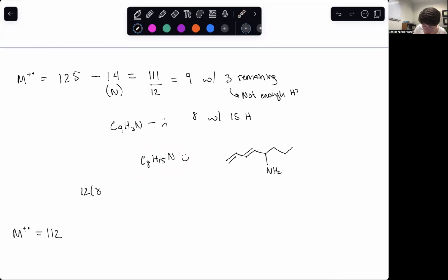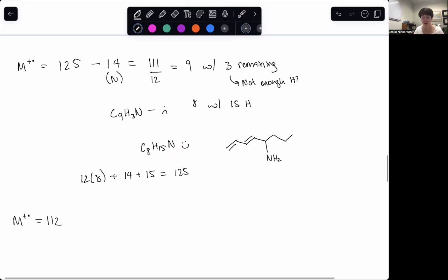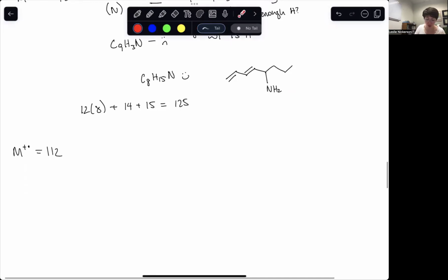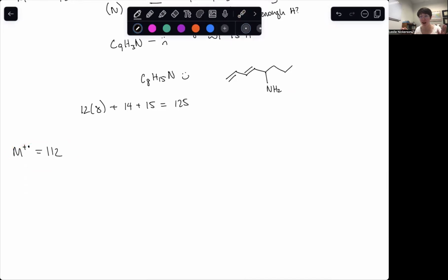Okay, and again, we'll follow up with our final little check. So 12 times 8 plus 14 plus 15 is 125. Okay, just to double check that we did our math correct. All right, so then we've got another one, 112, and let's say we have some other data in addition to our mass spectrum, and from our IR, we can see that we've got a carbonyl or something. So I'm going to start off by taking away an oxygen.